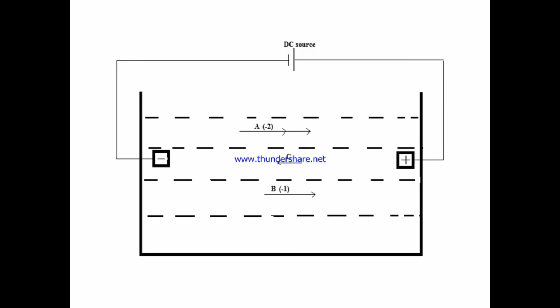Even if two molecules have the same charge, they might not migrate together because if there is a difference in their molecular weights, they will have different charge to mass ratio. This difference is of more use in electrophoresis on gels. Taken together, these differences are sufficient to ensure differential migration when the ions in solution are subjected to an electric field. And this is the basis of electrophoresis.